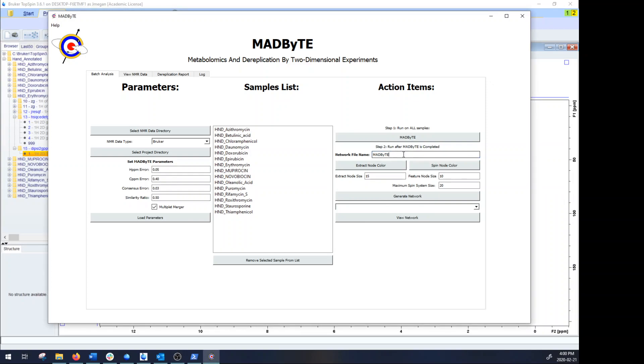Down here you'll see network file name. You can name this anything that you wish. So for instance I could name this something like standard compounds one, and then the networks will all come out with that as a prefix so that I know what I'm looking at.